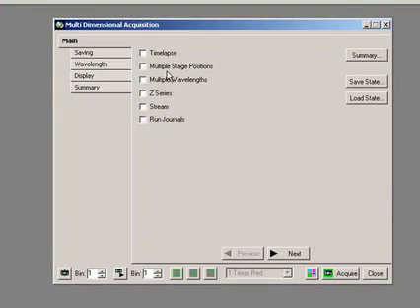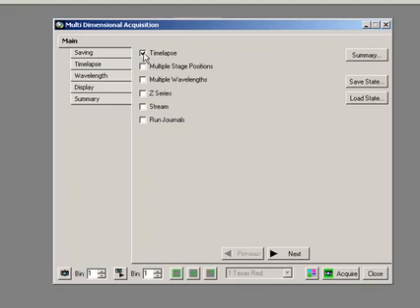At any stage I can press timelapse and I can see that now I actually add a tab for that. So let's look at how we would control the camera first of all, and how to take one or two images.